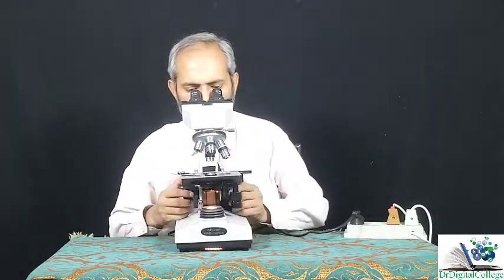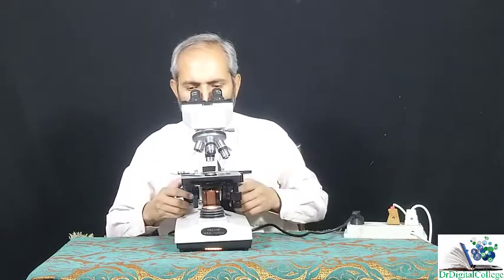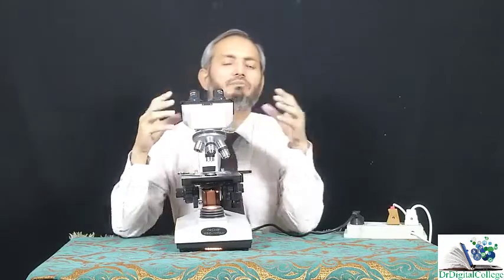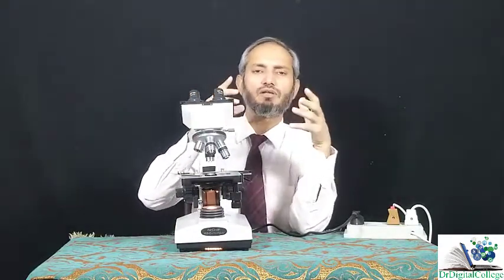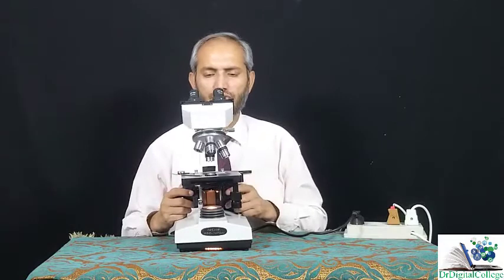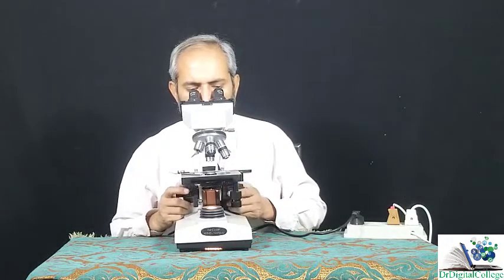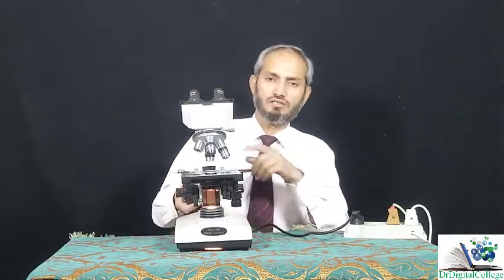I am observing right now, and you will move one or both of your hands to adjust the diopter according to your eyes. Some people might be using only one eye; they are more comfortable using one eye. Other people might be using both eyes. Whatever the case is with you, you will be observing here and you will move your stage slightly up. If it is locked, remove its lock.